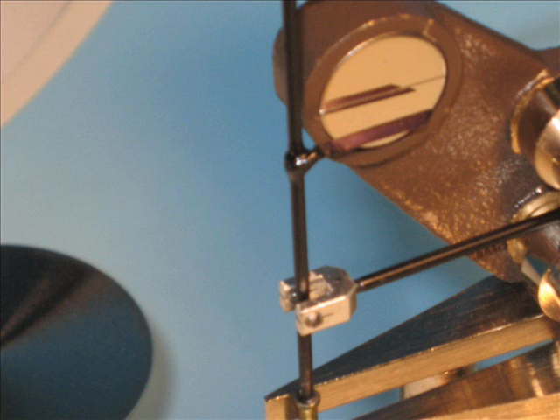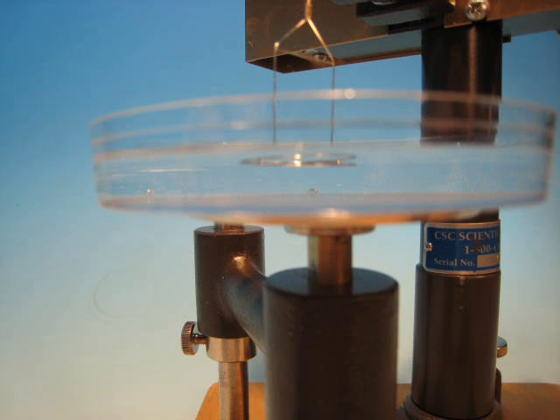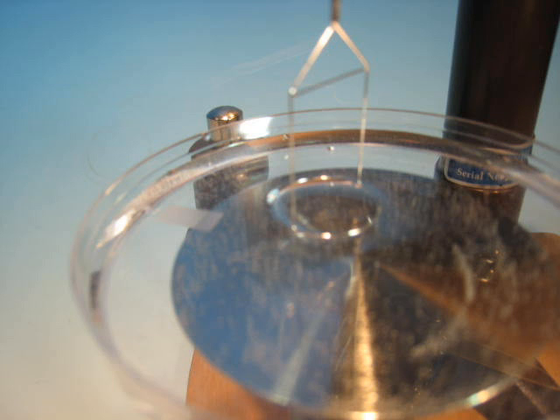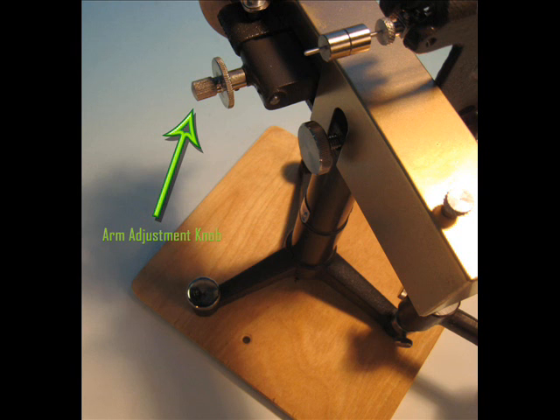With the ring below the surface of the sample, begin to lower the sample table with the sample table adjusting screw. When the ring approaches the surface, the pointer will move below the mirror line. At this point, use the arm adjustment knob to move the pointer back to the mirror line.